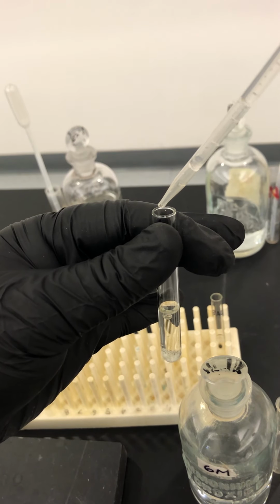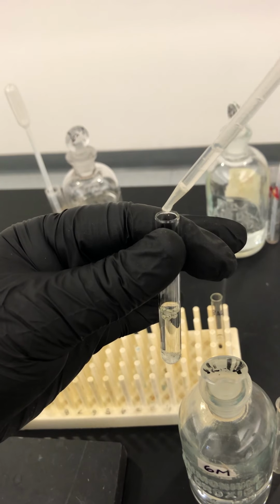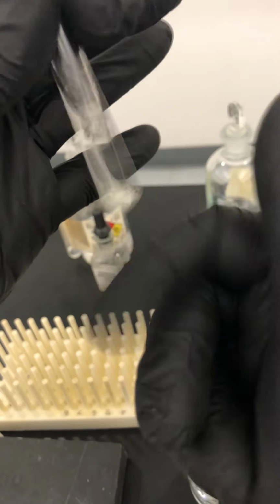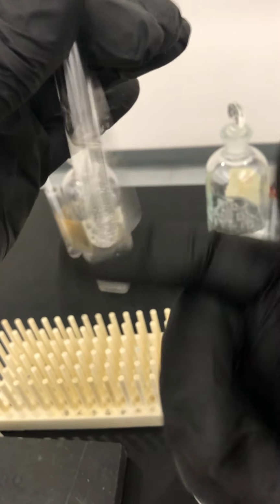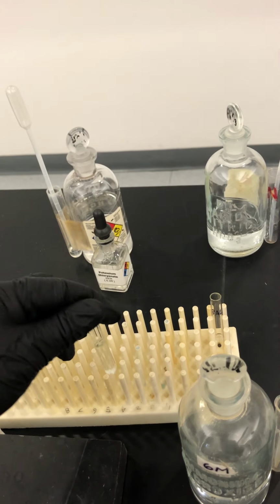So I'm going to add a few more drops here. Remember, this is not quantitative, it's just qualitative. So we're going to see what happens. I'm going to stir it some more, and then I'm going to put it away and see what happens, okay?